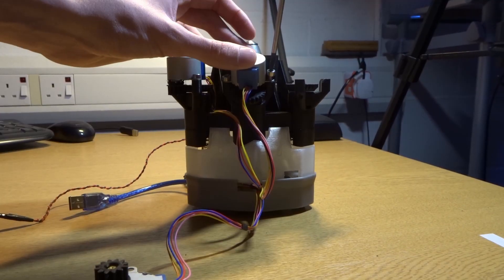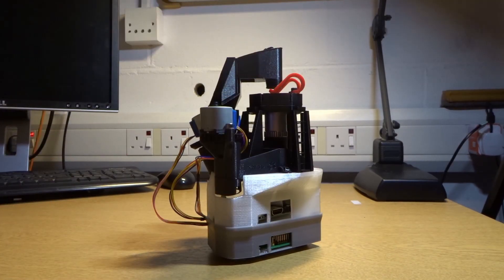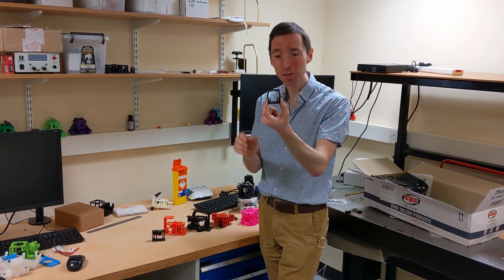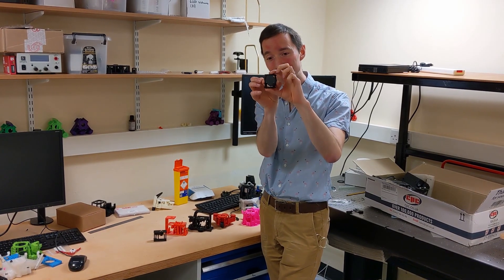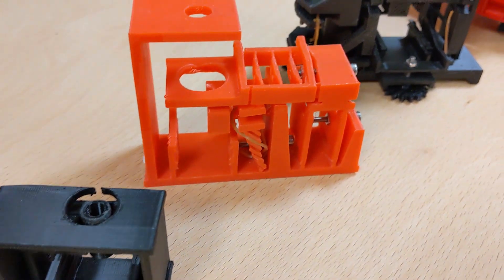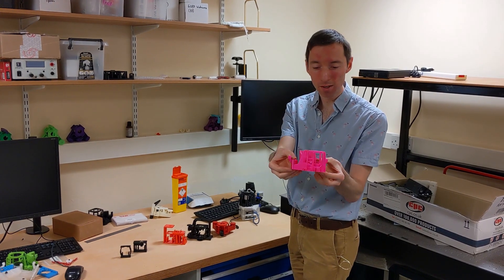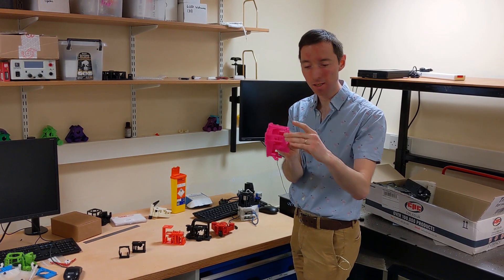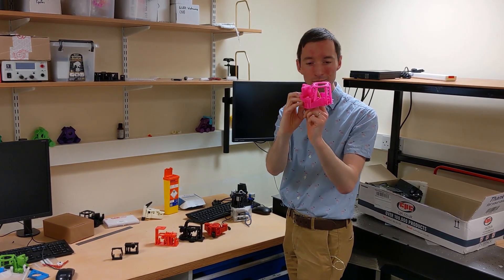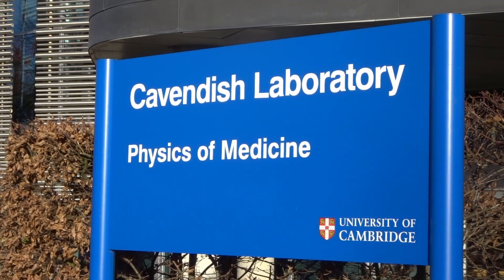Richard Bowman, the leader of the OpenFlexure project at Bath University, explains the evolution of the microscope's design. So it all started with a very simple version 1, where you squeeze it and the top moves up and down. And it got steadily more complicated until we ended up with this, which actually moves really quite nicely in two dimensions on this stage here, and then focuses with this mechanism here. One of the main uses of the microscope is for scientific research.